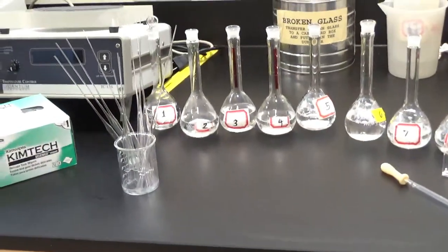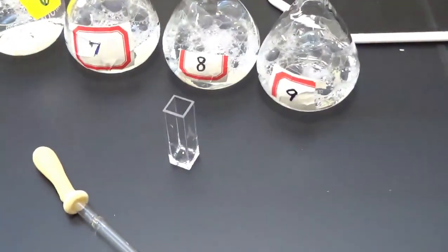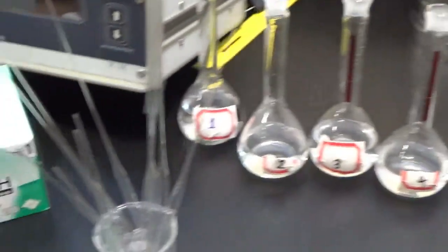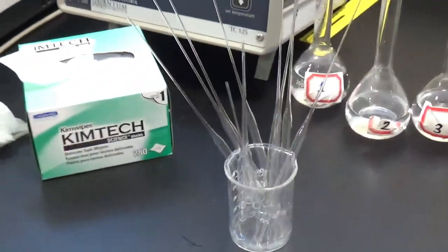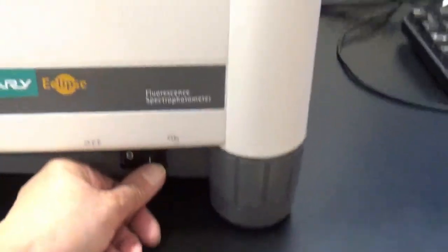Okay, so we're ready for the fluorescence part. I have a single fluorescence cell and all my 9 solutions, what remains of them. And I have a set of pipettes here and a whole lot of Kim wipes. And I'm going to turn the fluorimeter on. There's actually an on-off switch here. And I turned the computer on, but I'm probably going to have to wait a little bit because it hasn't been on for a while, and there was a power outage in between.